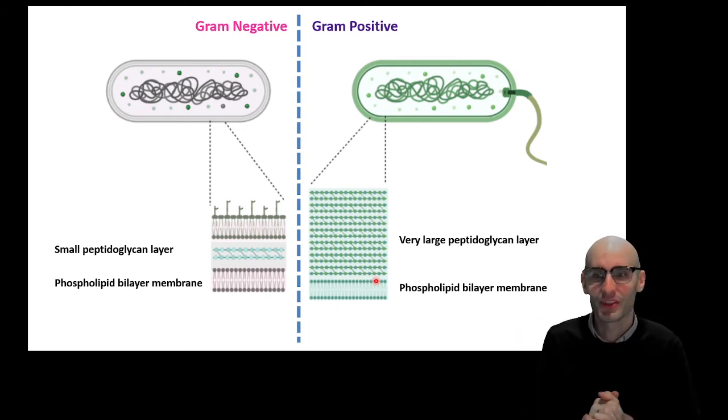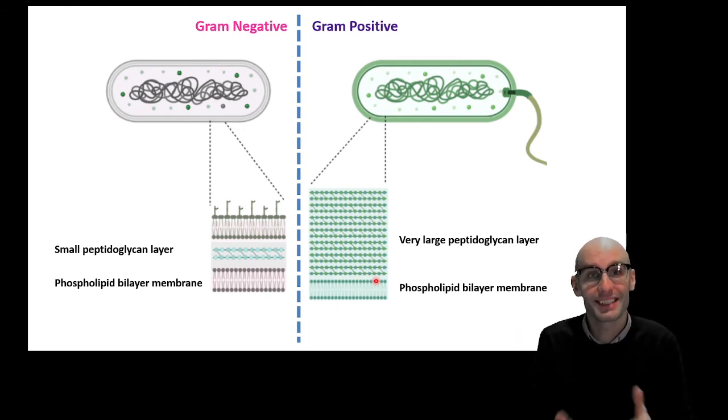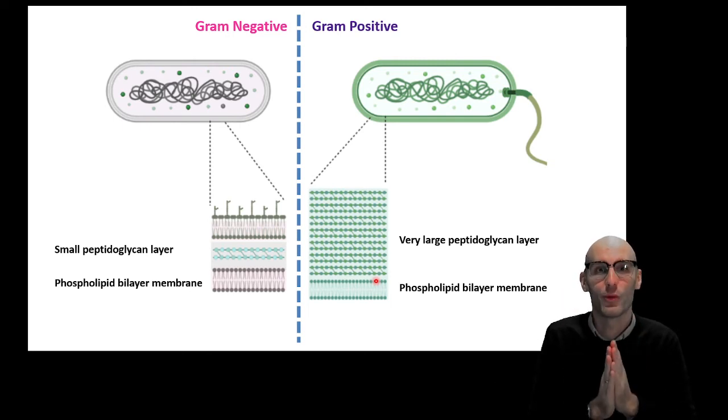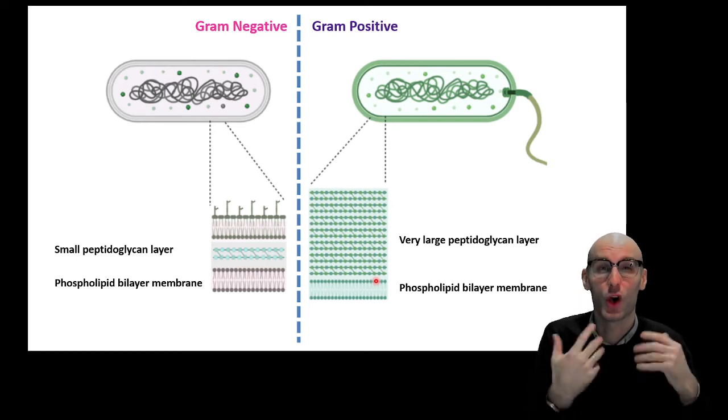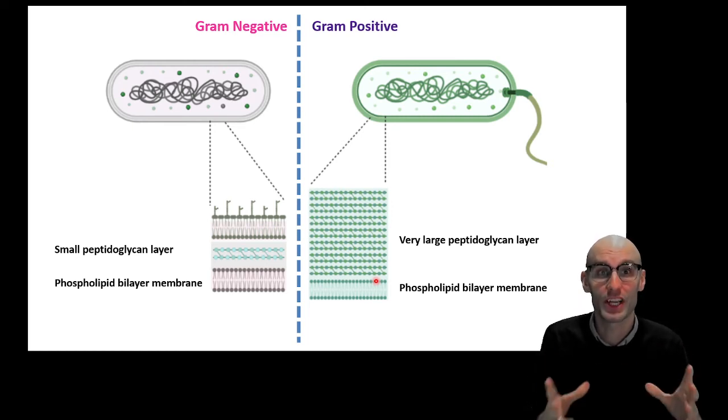Any of my cells in fresh water, they'll osmotically explode, whereas bacteria are resistant to that because they have that rigid cell wall that protects against that expansion and that popping that can happen under osmotic stress, like being in a freshwater solution with no salts.